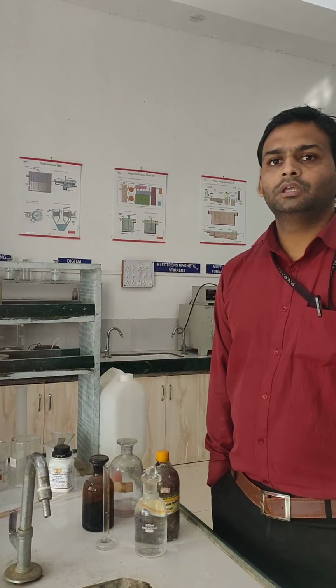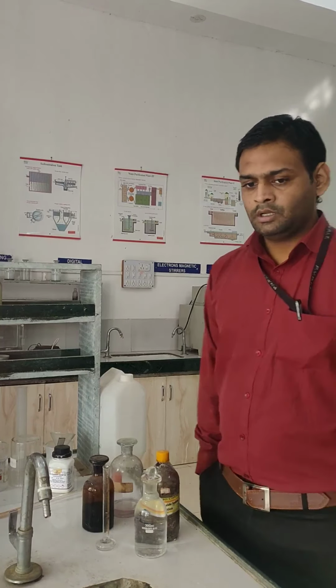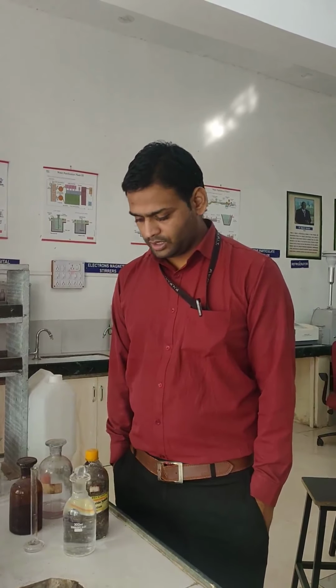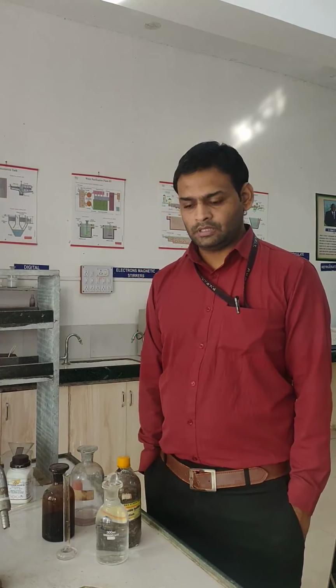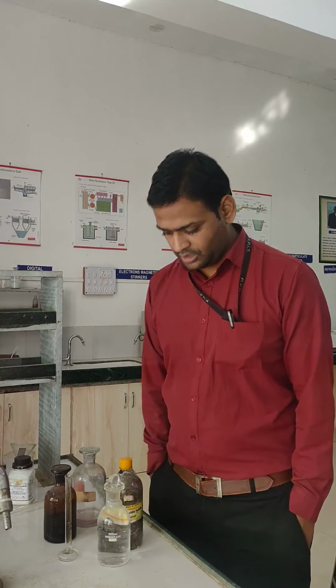Hello friends, today we are determining the amount of dissolved oxygen present in the water sample. So, first, the title of this experiment: determination of dissolved oxygen present in the given water sample.